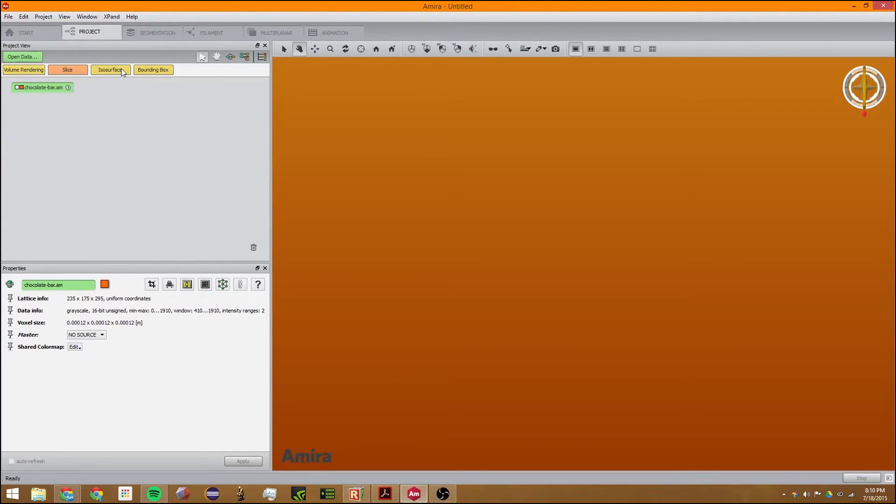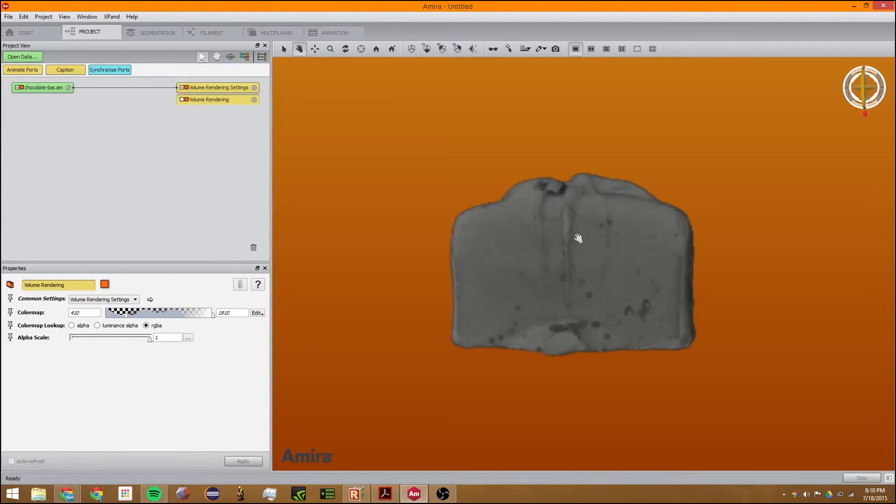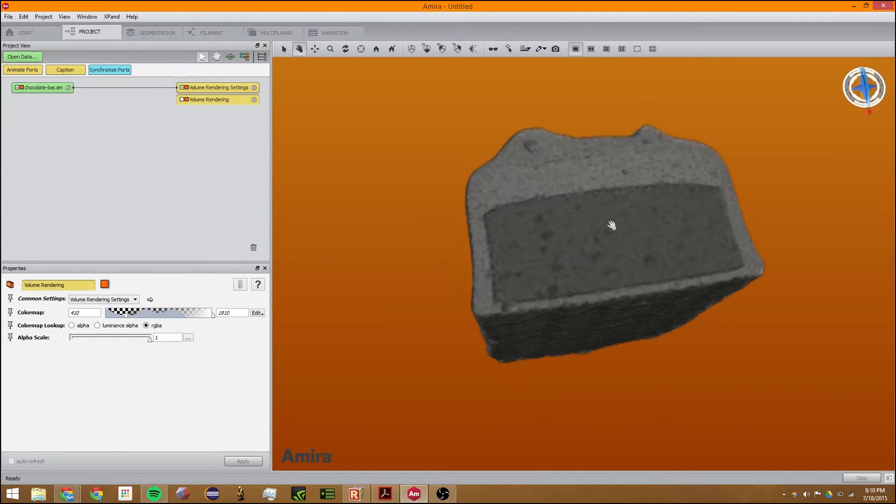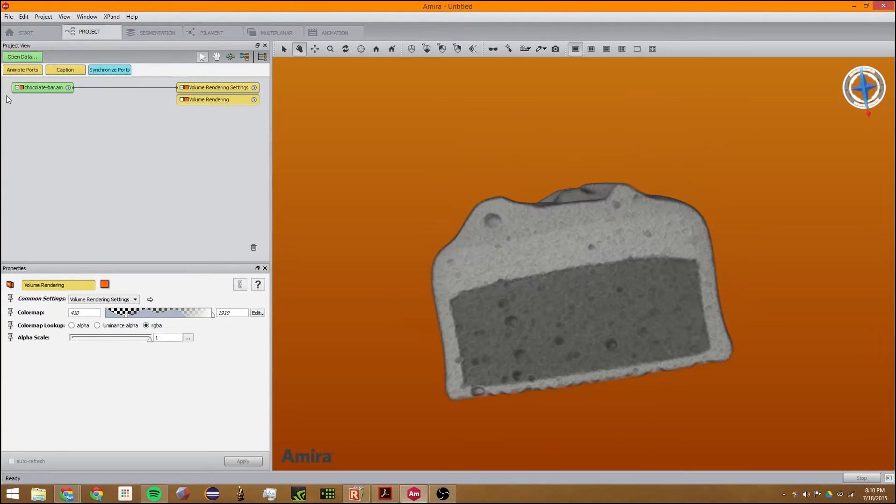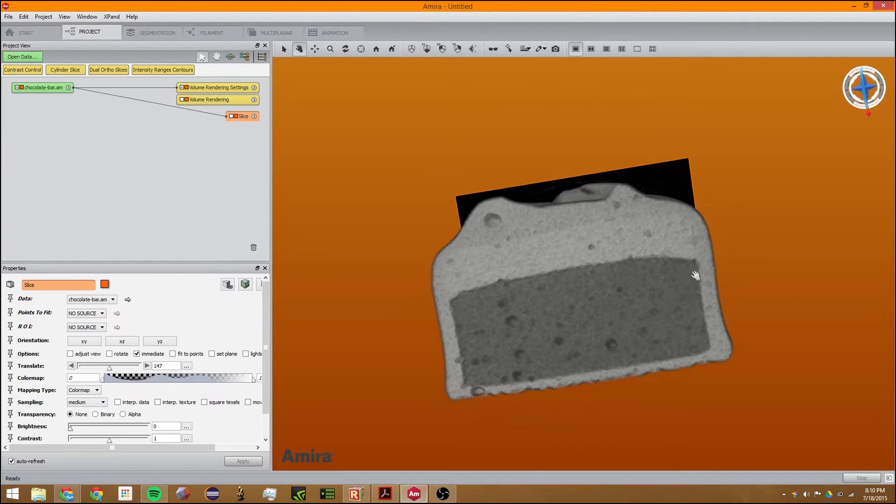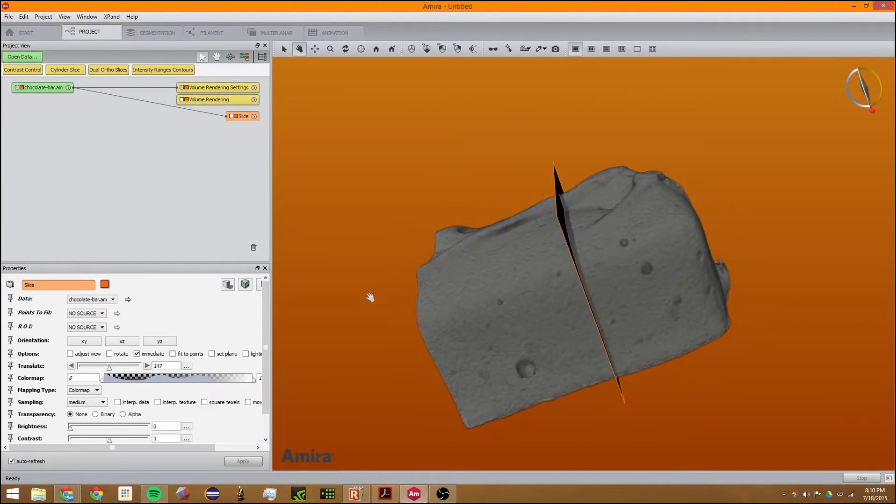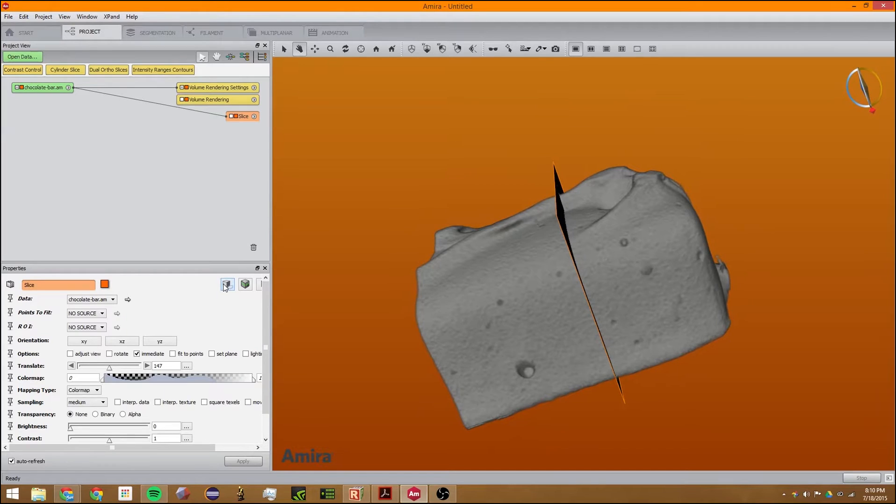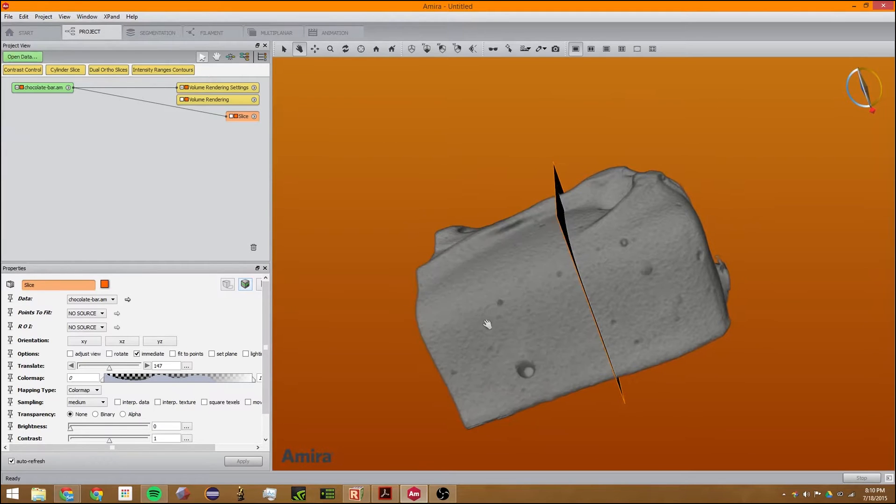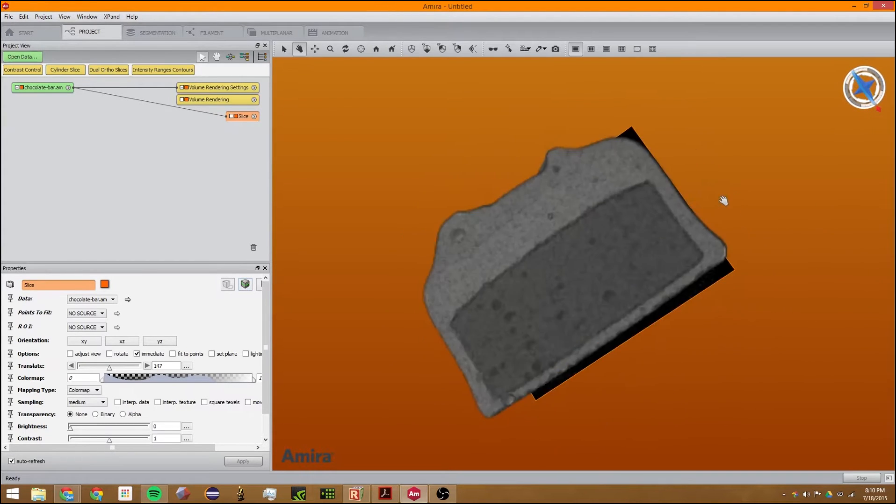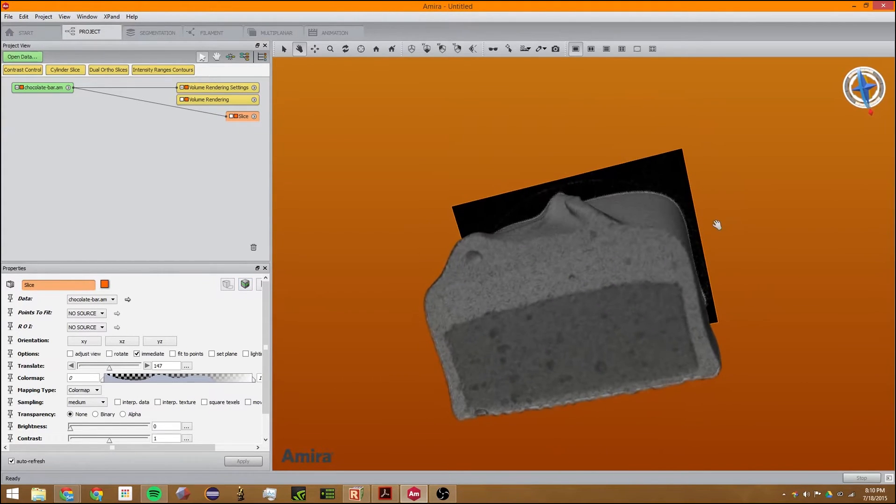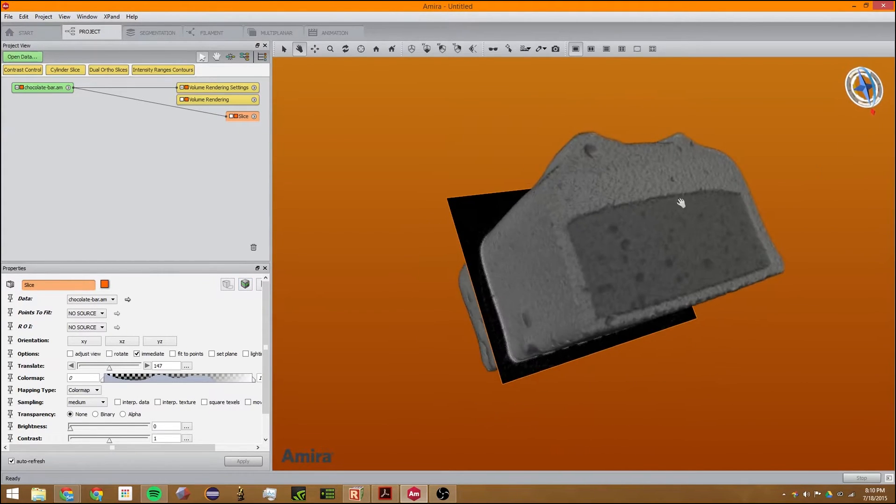You can click on volume rendering to see the data in 3D. You can also use ortho slices, which are slices inside your data. You can choose X, Y, or Z, and it will change right there.